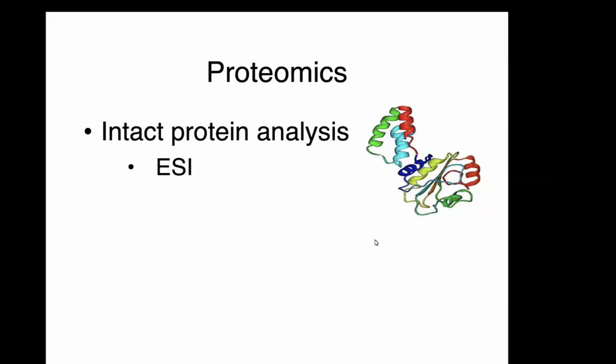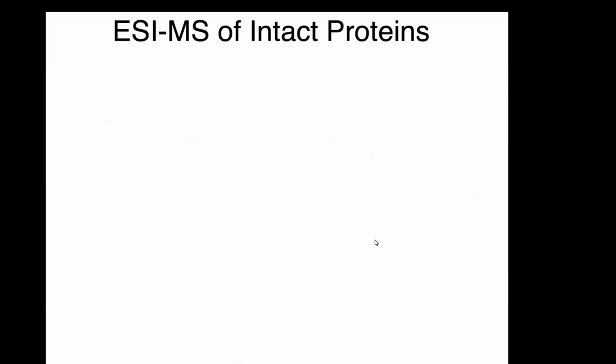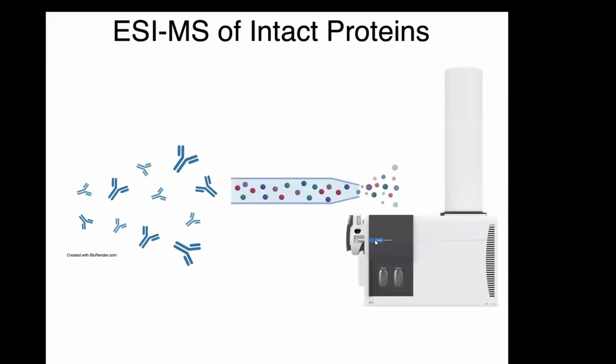The first of which is electrospray ionization. So when you do the LC-MS of intact proteins, we'll take the protein in a mass spec compatible buffer, usually avoiding any sort of interfering ions from detergents or other incompatible components. And we're going to charge that by electrospray ionization. In this image here, I have an ESI TOF pictured. We can either have an electrospray source paired to a TOF or quad detector.